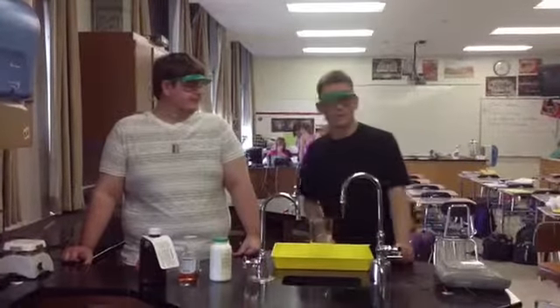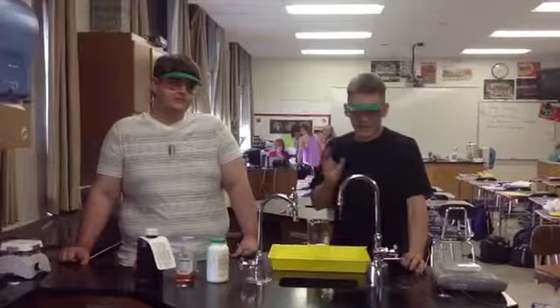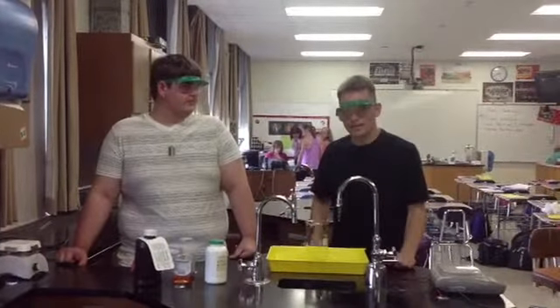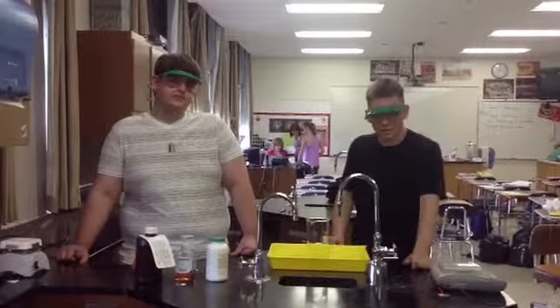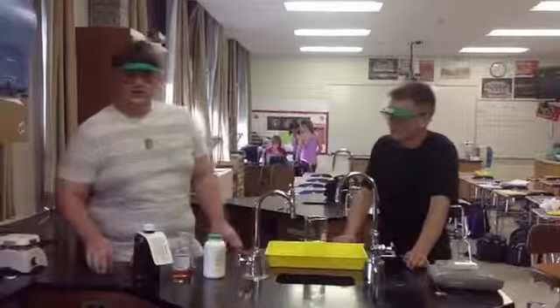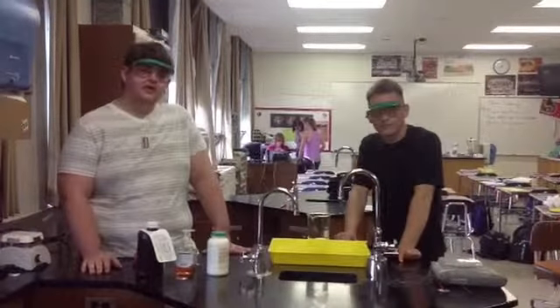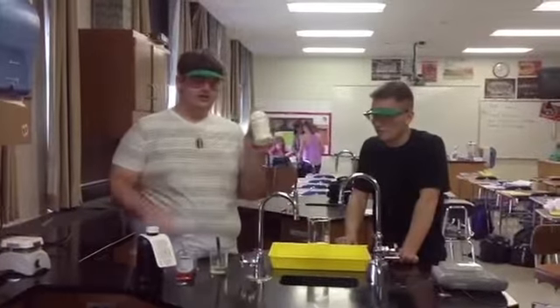We are going to be going over some interesting things today, specifically chemical reactions, a way that particles and atoms try to get to the most stable possible state. We have a very interesting reaction for you today known as elephant toothpaste. Zach? This reaction works as a decomposition of hydrogen peroxide with a catalyst of potassium iodide in this bottle here.